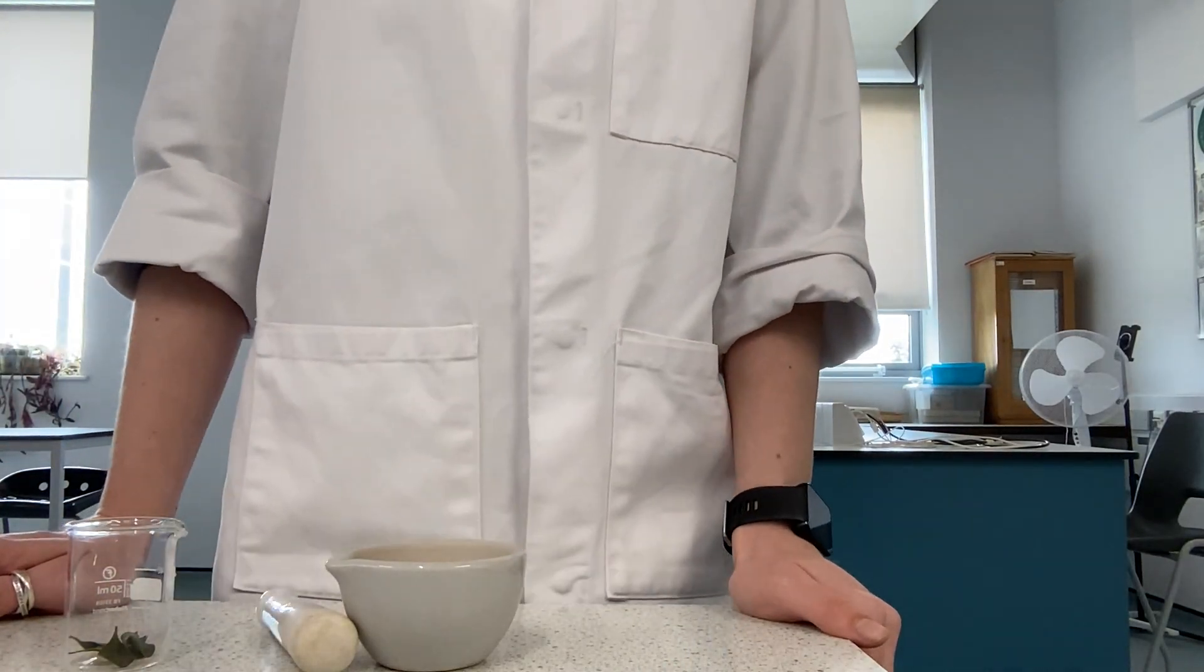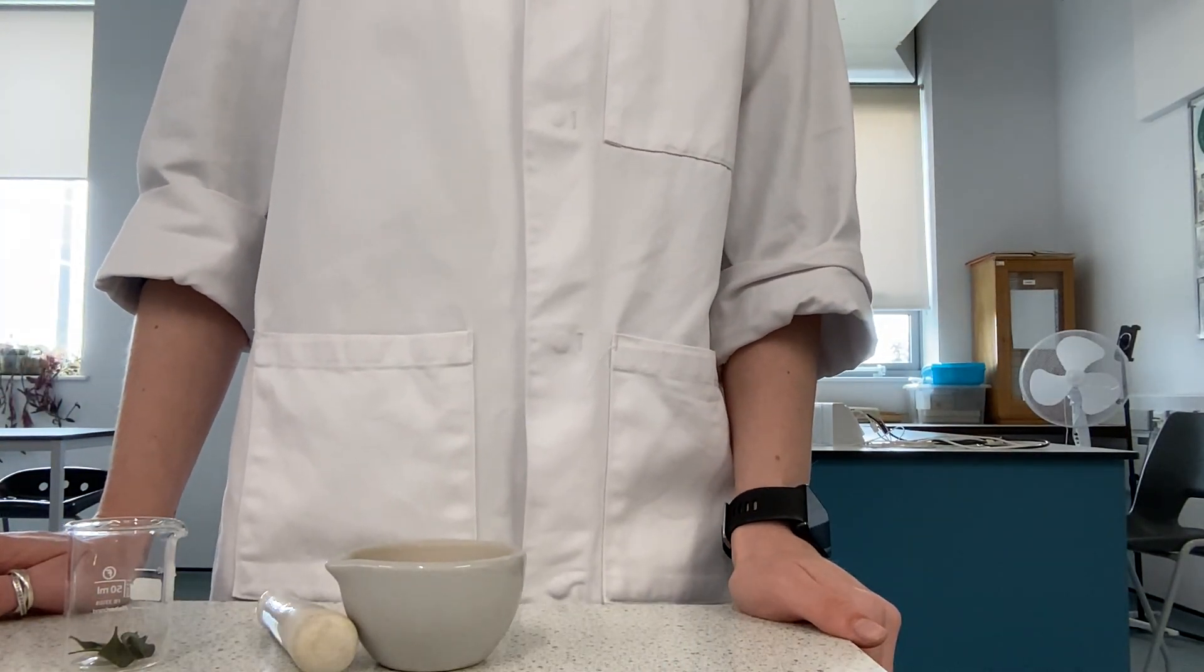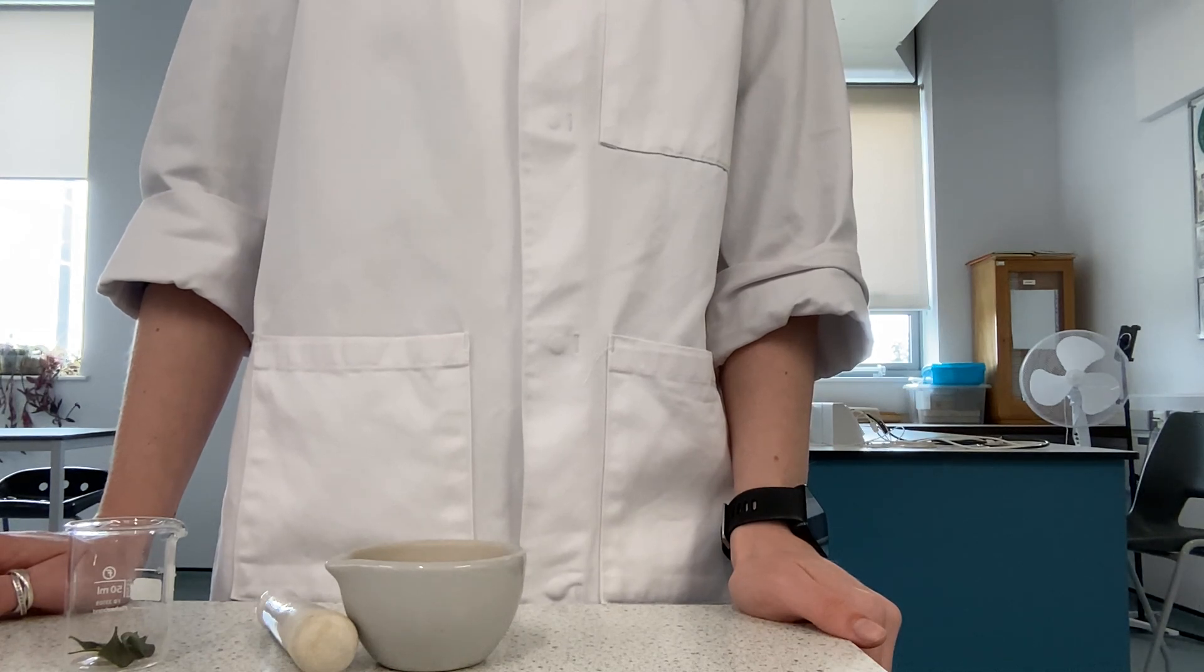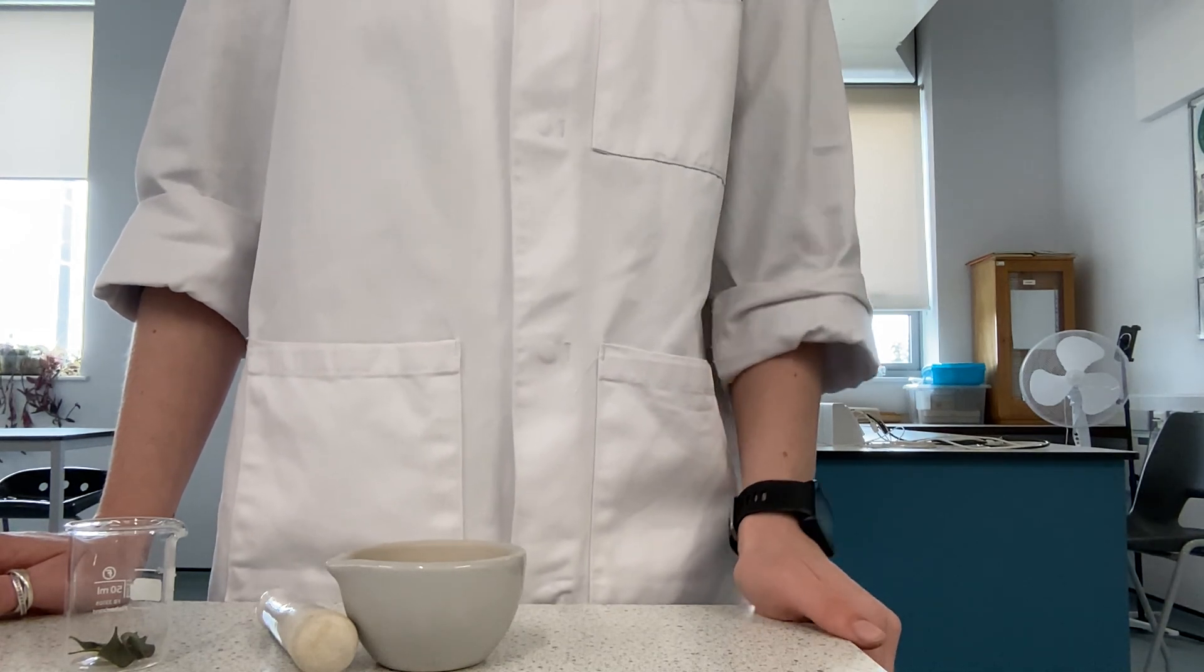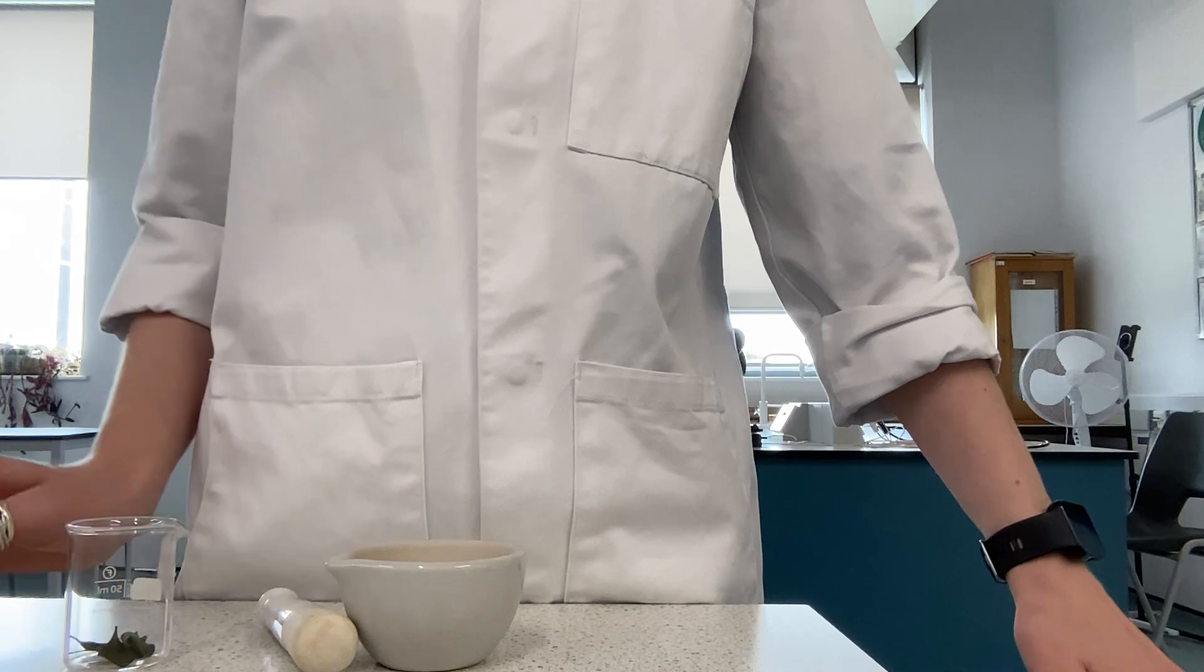Today we're going to be looking at PAG 6.3, which is where we're investigating using thin layer chromatography to separate photosynthetic pigments.